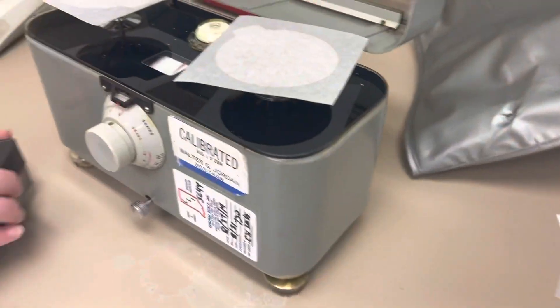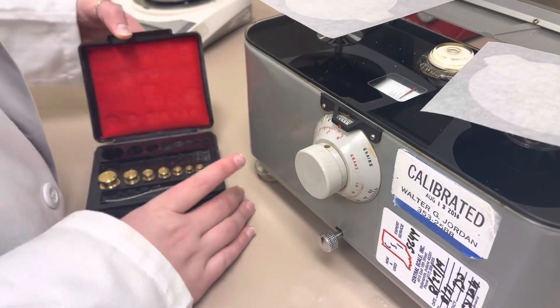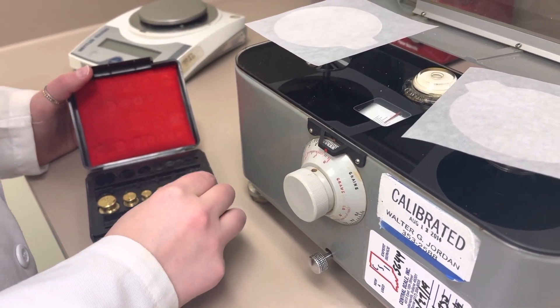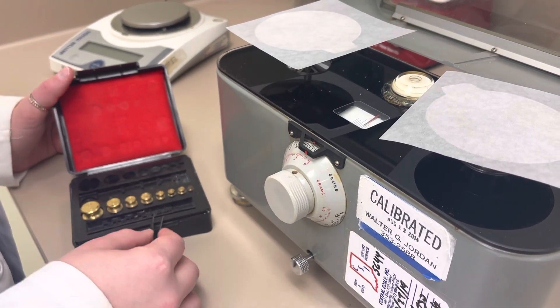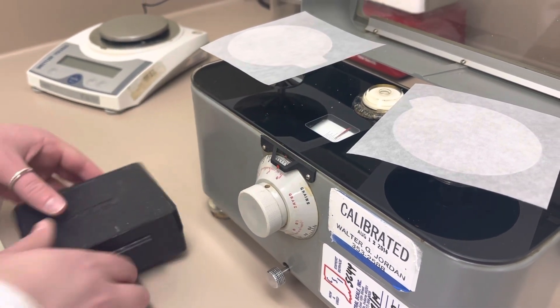If it's over one gram, you have to use the weights. You want to use the little clamp so you don't touch them with your fingers. The weights go up by certain intervals: one, two, five, ten, twenty, and fifty — and you can obviously combine those.